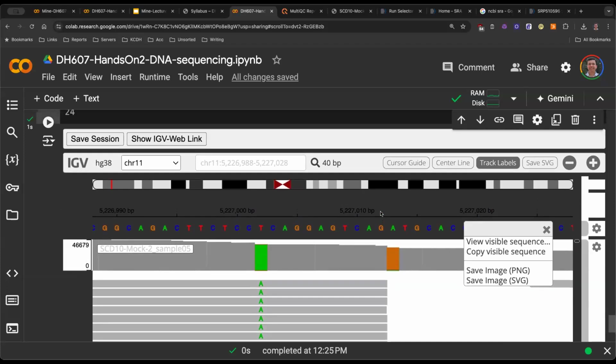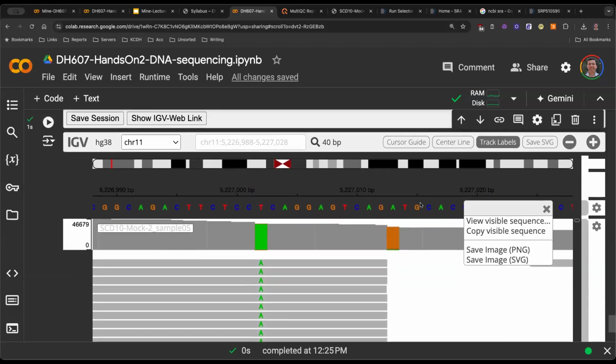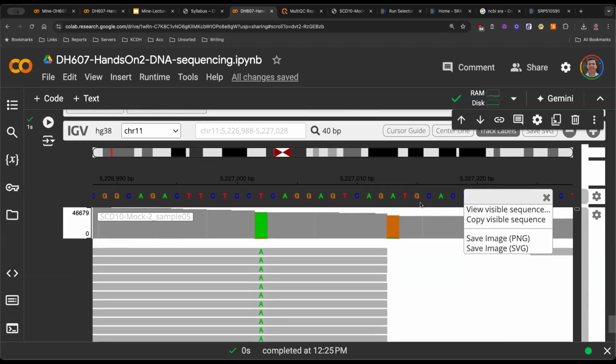Okay. So I'll show you one more. In the final notebook, when you actually go and look at the protein sequences, this is where your valine is. But this is T to A, right? What went wrong? The original mutation that I was interested in was A to T. What went wrong?